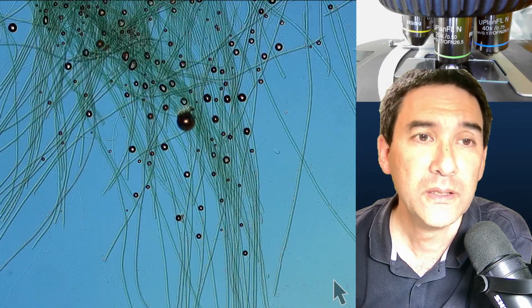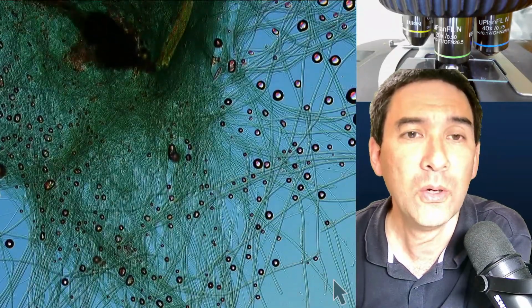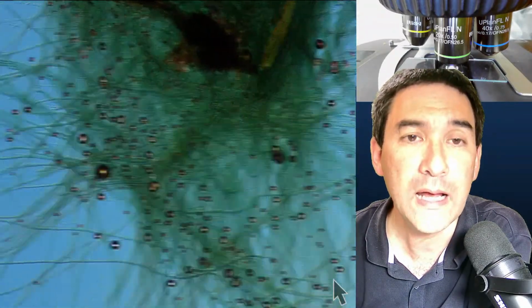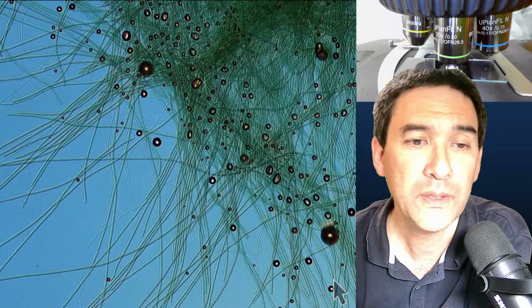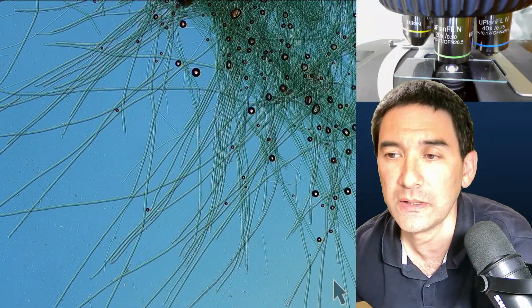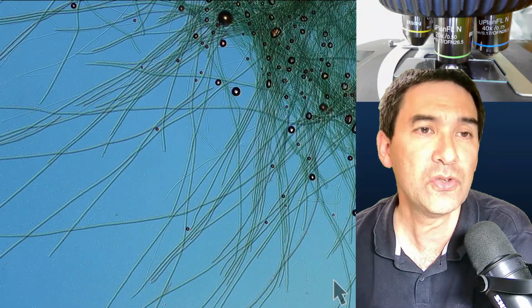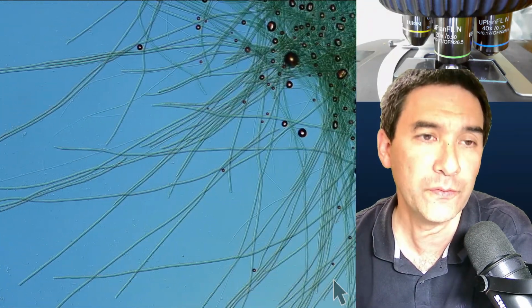Okay, so that's an issue maybe, but we're going to see how the bubbles behave when it starts to dry up. But I just wanted to illustrate this to you a little bit, to show you the importance of mounting medium.